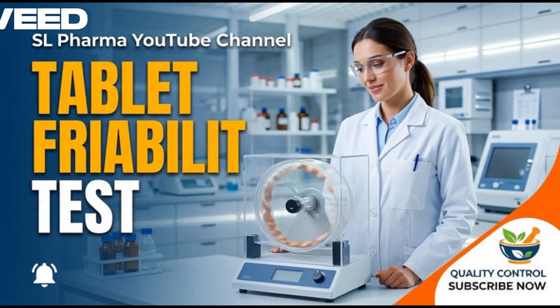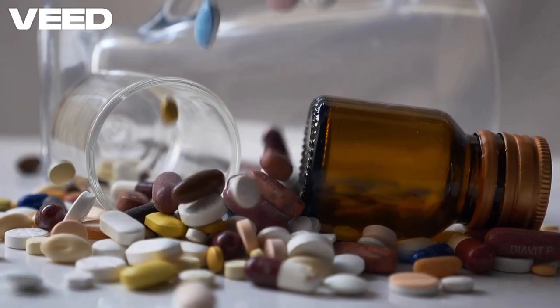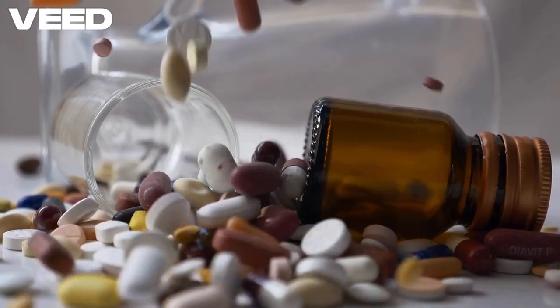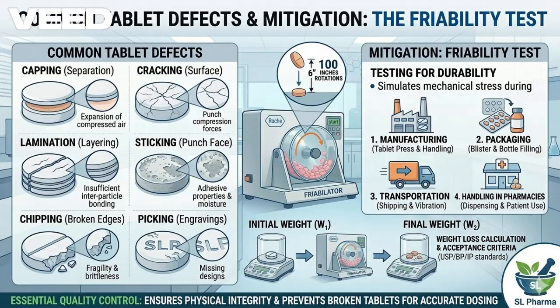Today we're going to talk about an important pharmaceutical quality control test called tablet friability. Tablets go through many processes such as manufacturing, packaging, transportation, and handling in pharmacies. During these processes, tablets may chip, crack, or break. To make sure tablets are strong enough, we perform a test called the friability test.